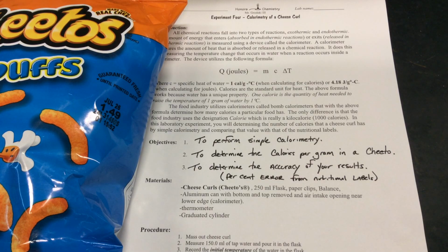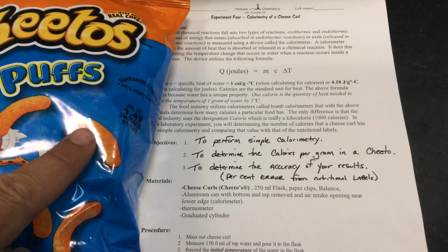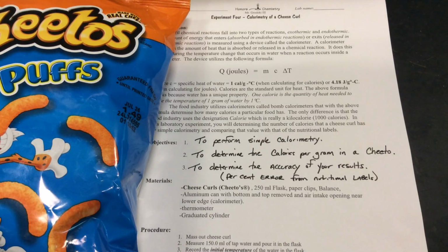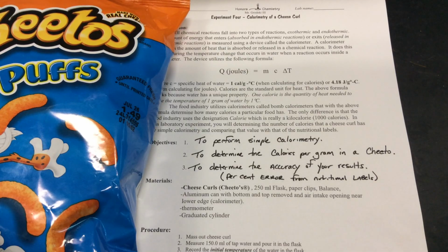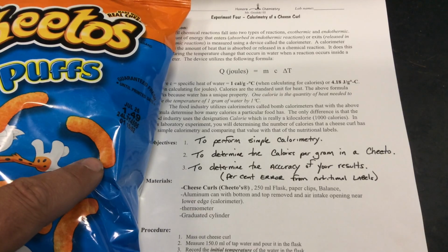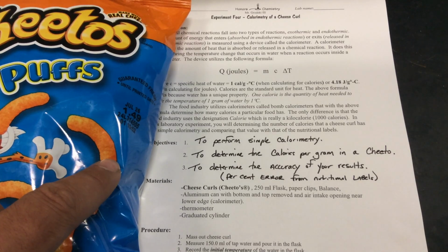You say, why per gram? Well, because every Cheeto is going to be a different size, and the energy stored in the chemical bonds of each Cheeto will be different because each Cheeto is not the same. But if I take my Cheeto and divide by the grams of the Cheeto, then I get the energy per gram. And notice we're trying to come up with calories per gram.